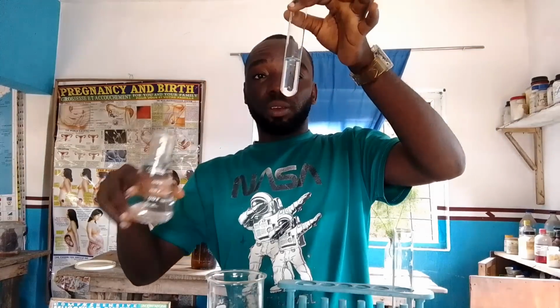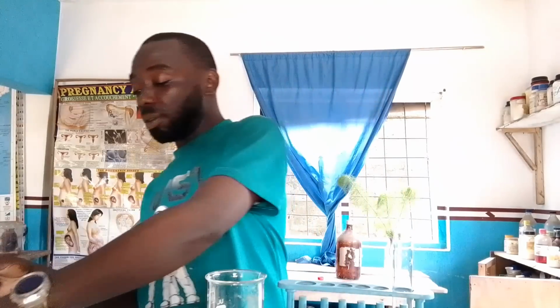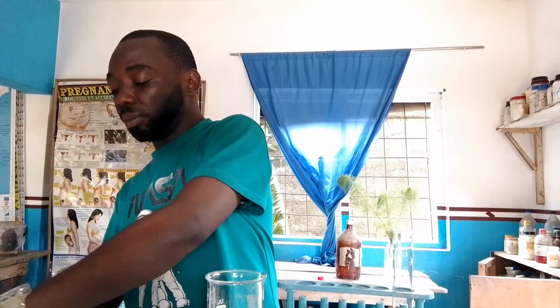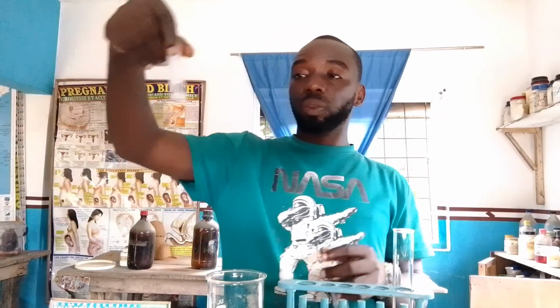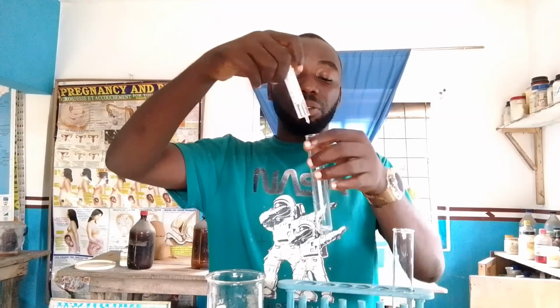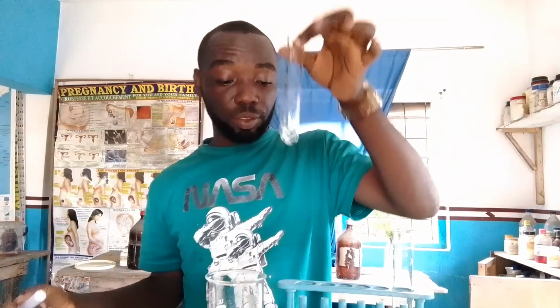3 ml of water. Okay, let's assume that this is 3 ml, or possibly you can use your syringe to measure the 3 ml of water. So look at it, we already have our 3 ml of water. So add our 3 ml of water in the test tube.